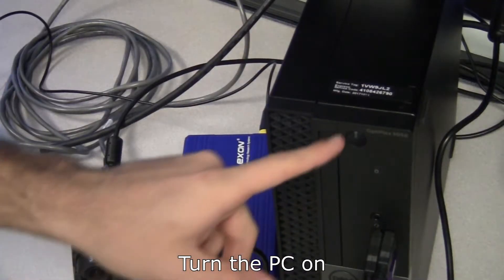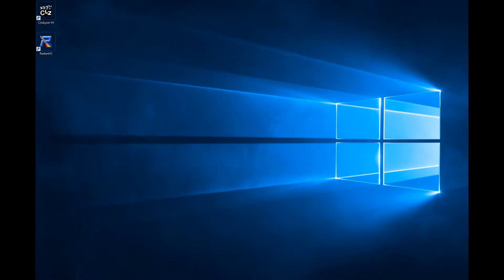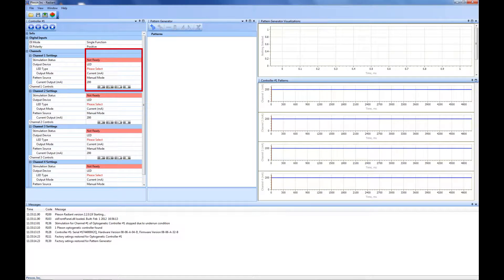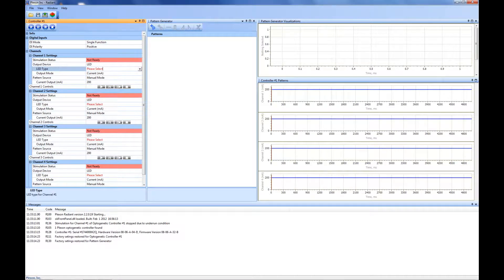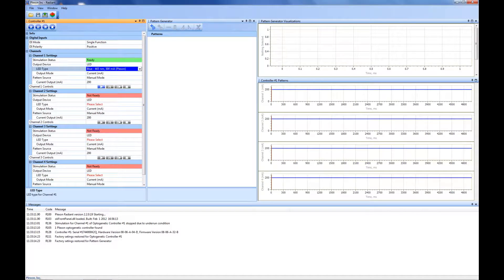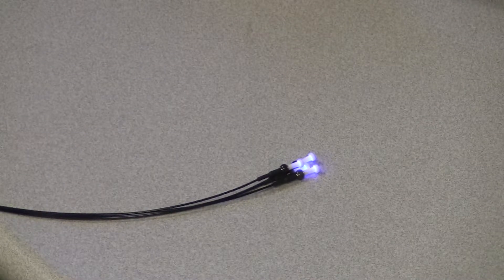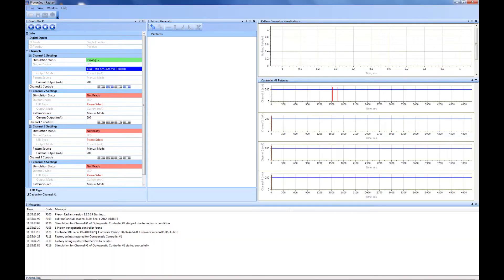Next, turn the PC on. If you are using the 4-channel optogenetic controller, open the Radiant software. For the purposes of this demonstration, we have our LED module connected to channel 1. Ensure that LED is selected in the drop-down menu and select 465 nanometers for the blue LED module in the next drop-down menu. Press play and verify that the patch cable is emitting light. For additional information on the Radiant software, please refer to the Plexprite 4-channel optogenetic controller with Radiant software user guide at plexon.com.